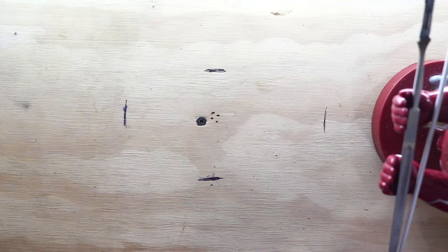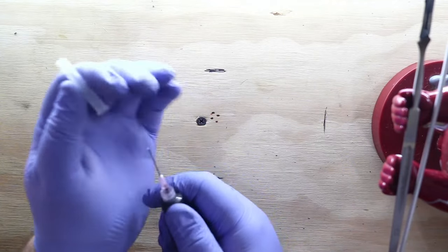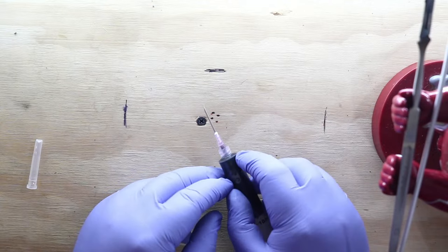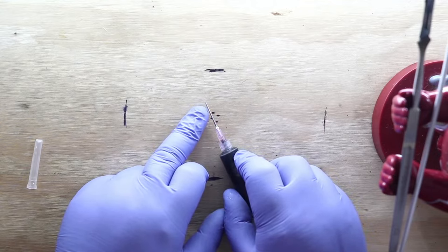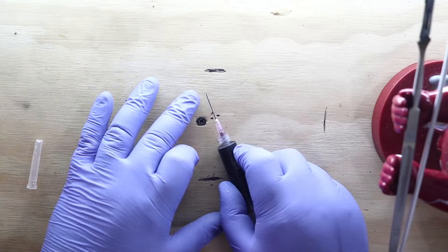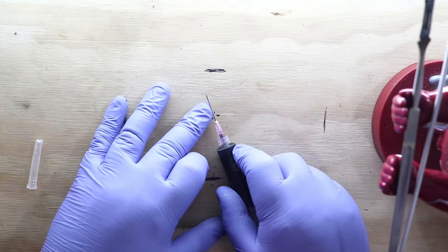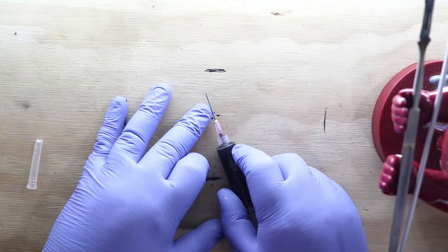For cloning, I have trouble getting my needle biopsies to stay in the tip of my syringe. Any tips? Yes. So here's this needle we were working with earlier. All right, Samantha, can you see the angle on that needle? Not really. You might have to go down. There you go. Okay, can you see the hole? Yes. All right, when I turn that and there's this angle here, a lot of people think of needle biopsies as a stab and that they're getting something on the inside of that. Think about this, though. When they put a needle in your arm and they stab it in, and pull back out, they're not bringing a core of flesh with them, typically, right? And in fact, a lot of times they leave the needle in there for an IV or something. So, obviously, when you're stabbing, it's not coring.